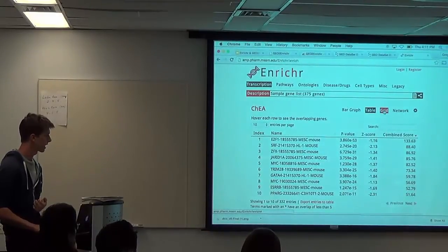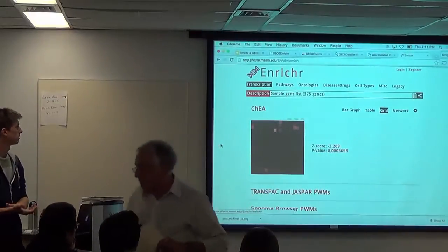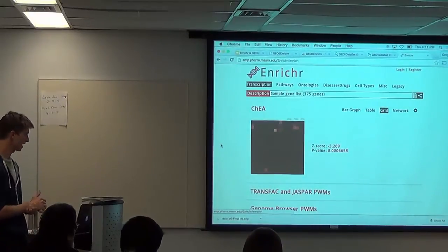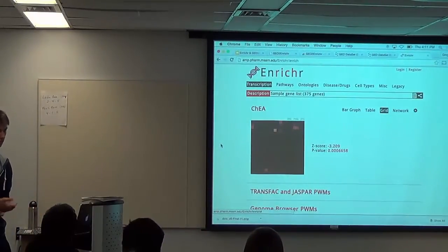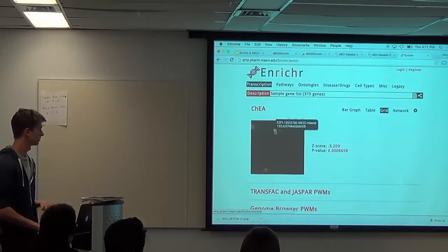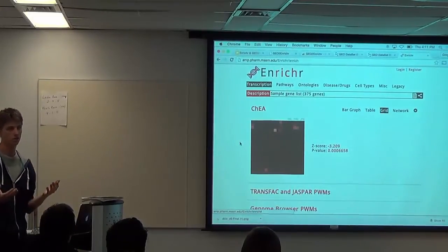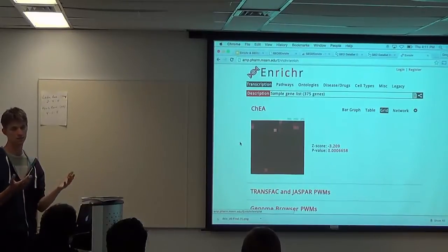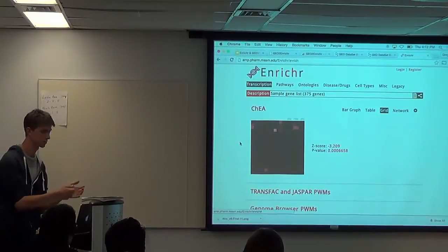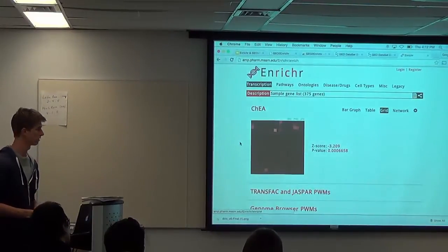We also have the canvas or grid view. Here each tile is a gene set, one of our library gene sets, and its color indicates the level of enrichment. We can mouse over it to get the name of that tile. The tiles are organized in such a way that they're clustered together so that regions of this canvas have similar gene sets based on the overlap again.